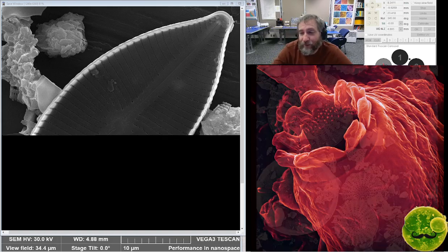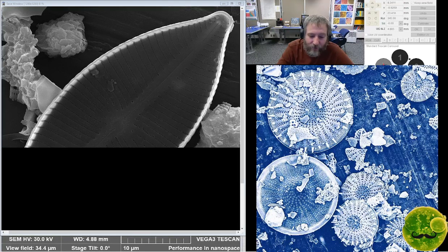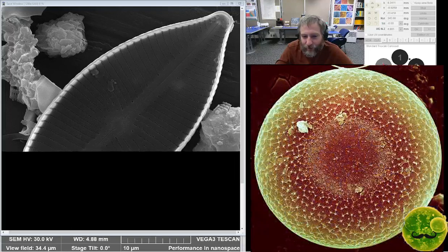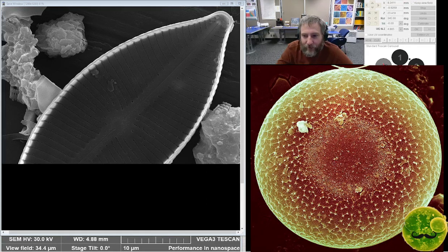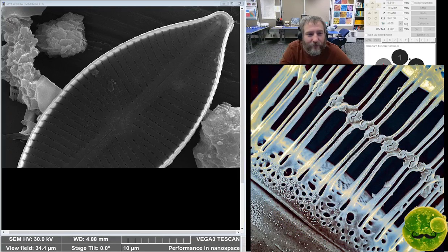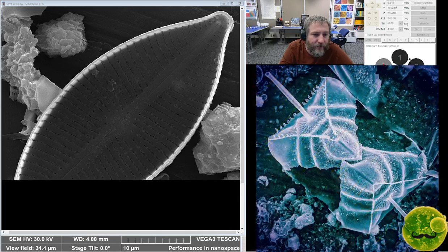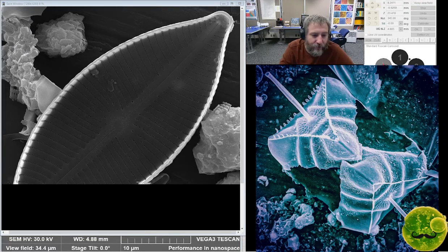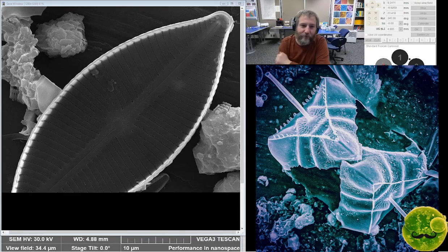Yeah, I'm sure that they have some. Sticks that fall on the ground are my recommendation for water bears. Then I take a dull knife and scrape the lichen into a dish, and then I fill it with a little bit of pure water. You could use distilled water. I don't recommend using tap water if your tap water has chlorine in it, because it'll probably kill them. But a little bit of distilled water or really pure water, wait 5 minutes, and stick it on a microscope.